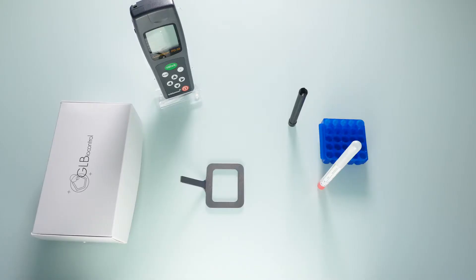The Dendidryak BF test allows you to measure the quantity of bacteria on surfaces such as found in the food industry, swimming pools, and pipes in just two minutes.